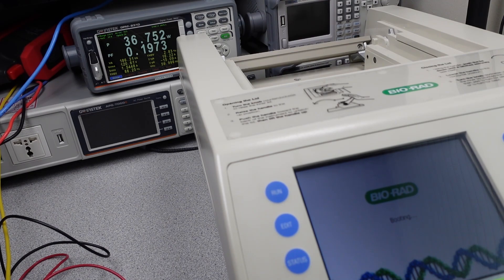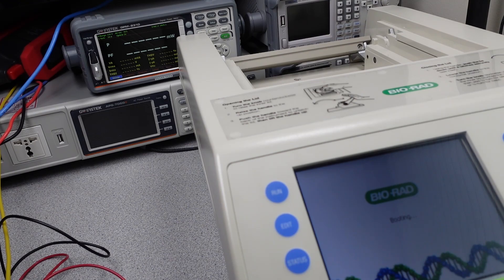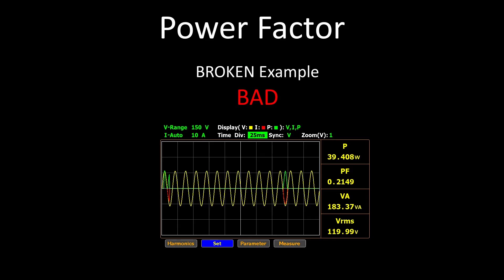You can see it starts and works for a small portion of the time, but then it doesn't stay on, fails, and then tries starting again. This hiccuping process is very common in power supplies. The power supply tries to start and then fails to stay on, so ends up consuming short pulses of current. Following the sine wave still, the power factor correction circuit doesn't stay on. I have a suspicion now.